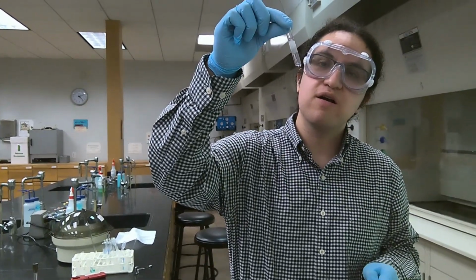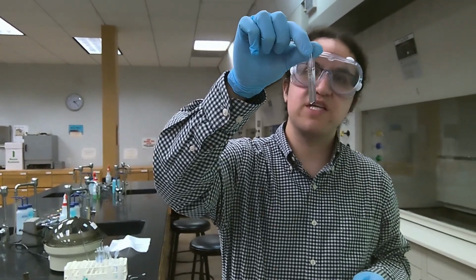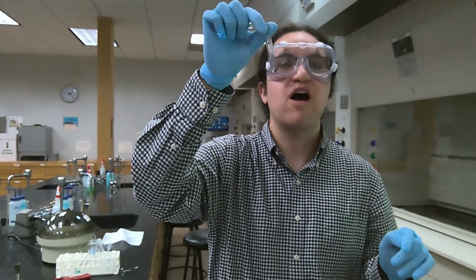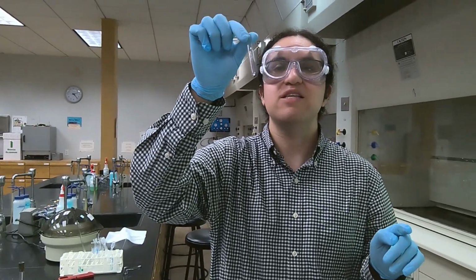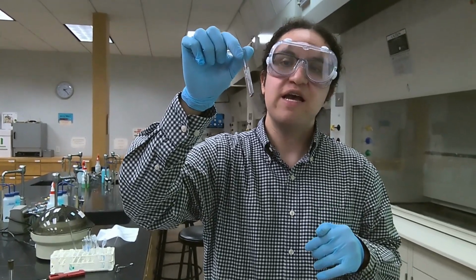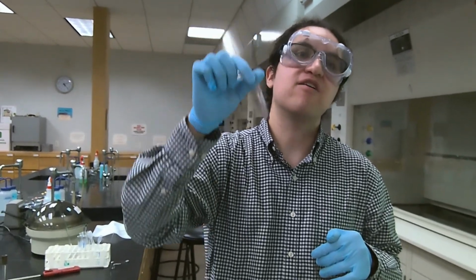Now we have centrifuged our copper, so now our copper is sitting at the bottom. We have a perfectly clear supernatant liquid. We're now going to decant and dry our copper. And in this process, the drying is exactly the same as the copper oxide procedure, and we'll return once we have dried our copper completely.